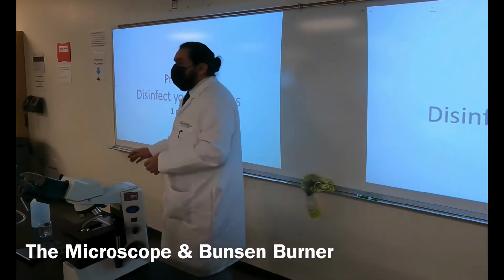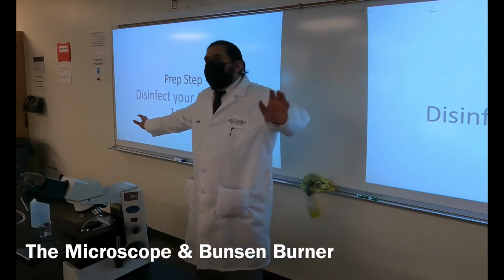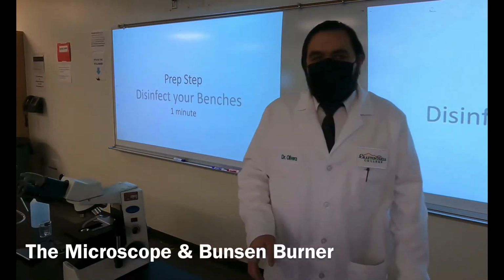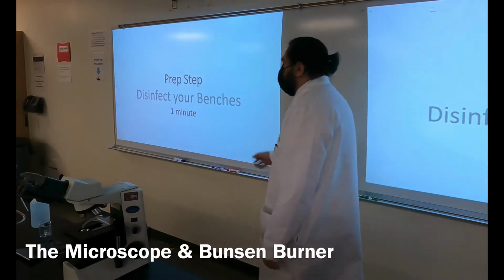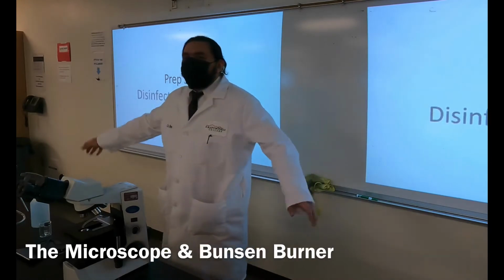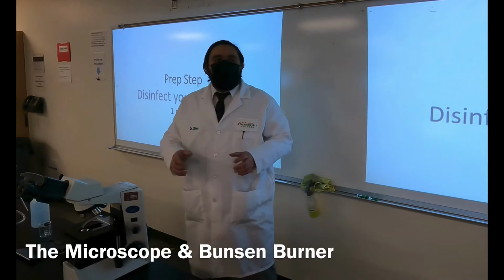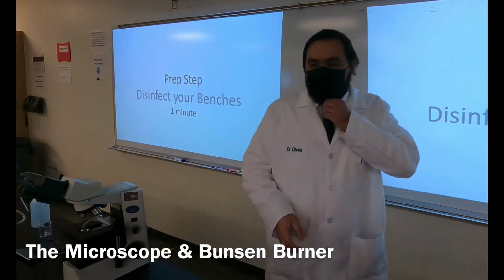Once you're done, there are a couple of trash bins in front of us. There's a couple of them in the back. Do not throw them into your biohazard, just a regular trash can, okay? So the trash cans are usually bigger, fatter. The biohazards, there might be some over here up front. Biohazards will always be red. Okay, just be aware of that.